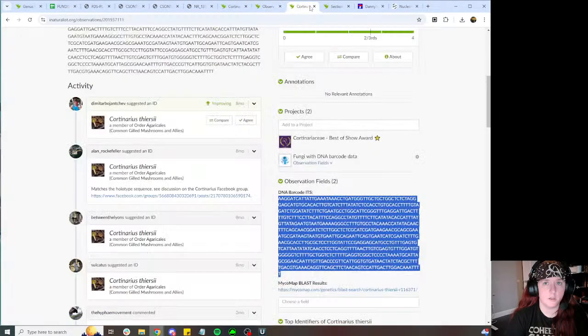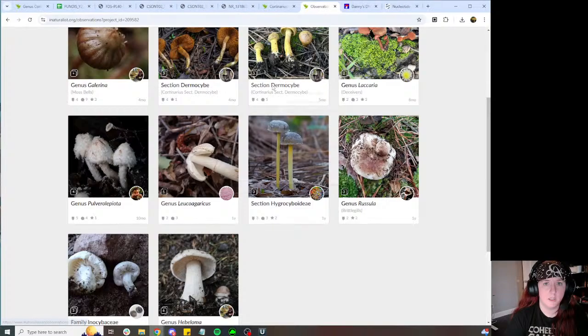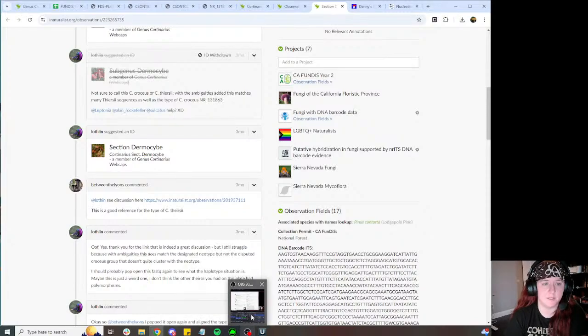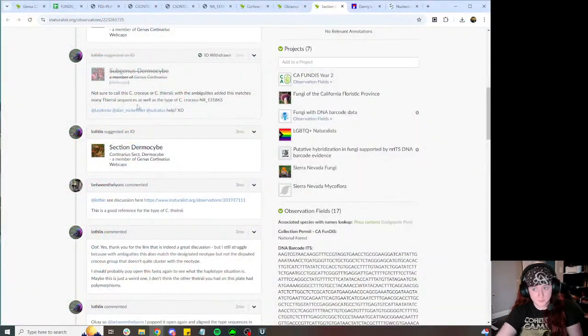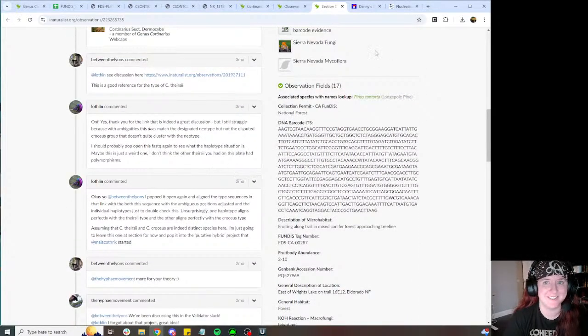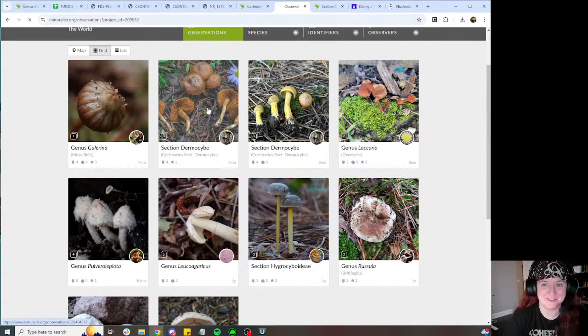But yeah, this is the nice thing about nanopore sequencing. You can actually pull out and see the individual haplotypes, which is great. You couldn't really do that with older styles of sequencing, but it does lead you to rabbit holes. I've been down some rabbit holes as a result.